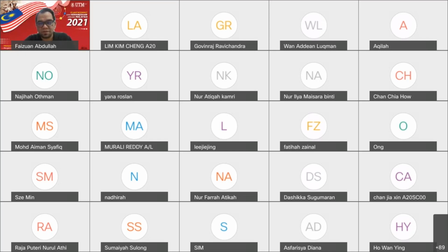Need to discuss, even though this is a simulation result. Can we use Excel? Yes, of course, you can use Excel and a calculator to get the equation. Of course, you need to use a calculator. If you are good enough, you can calculate the R-square value without a calculator. Of course, we can use Excel, because I've told you.